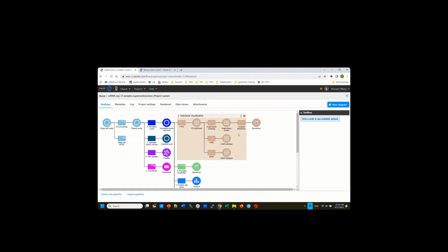And another one that is really purely for visualization: when you click on the PCA data node, PCA only contains PCA scores. It's basically for visualization. And if you go to the batch removal, here is another way, it's in the public domain, a pretty popular way called Harmony.